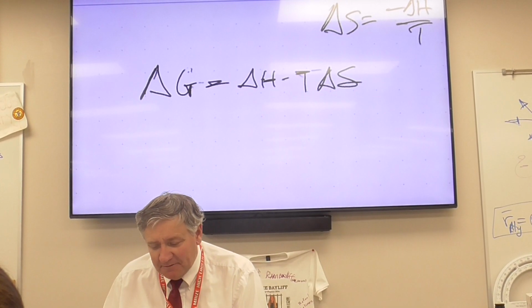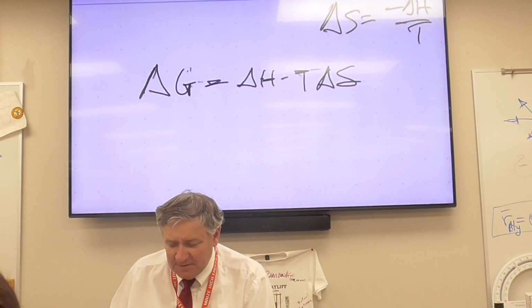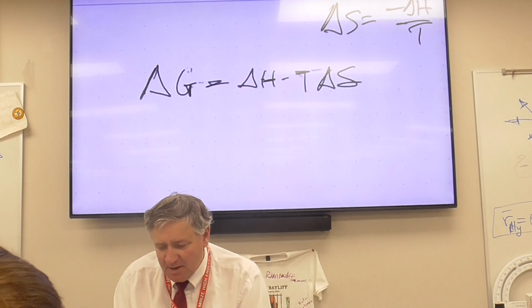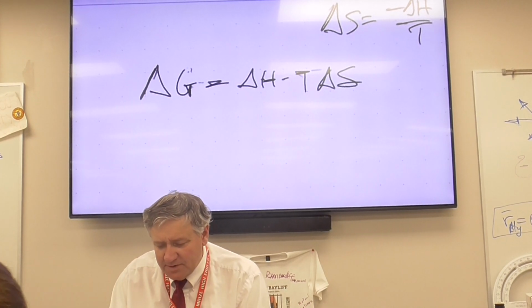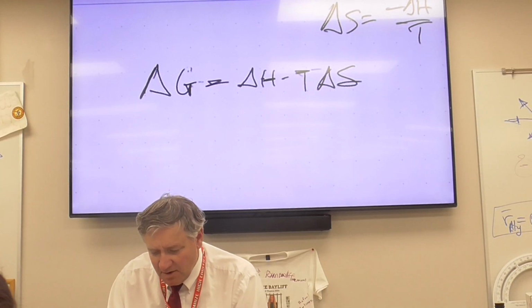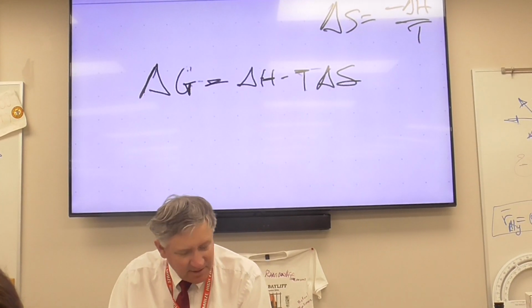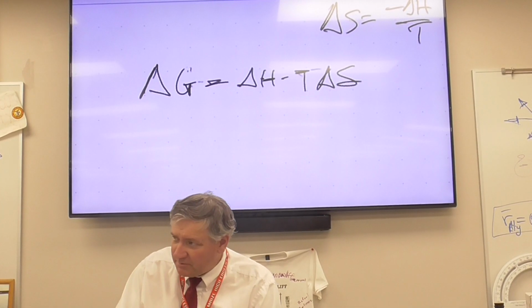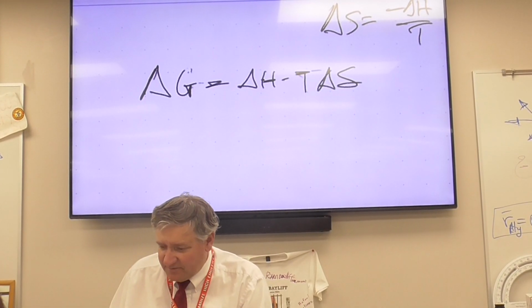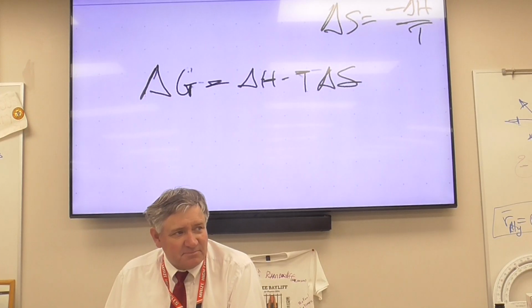Now, what you're going to do, and pay attention to the spirit of how I wrote this lab: we're going to record try 1 observations, okay? We're going to predict what the sign of delta G is going to be, and we're going to give a justification. Let me give you a hint. Delta G should be a negative value, and then, wow, the reaction took place.